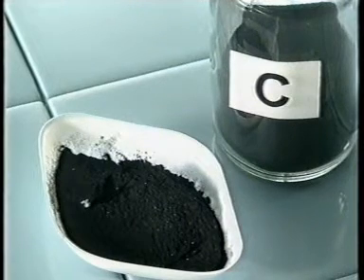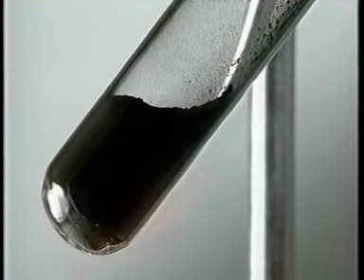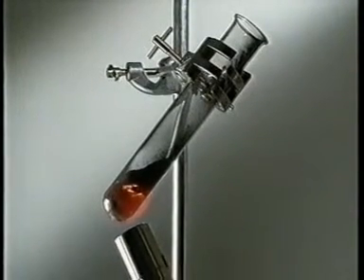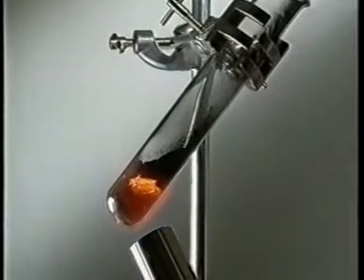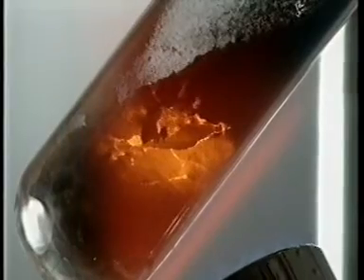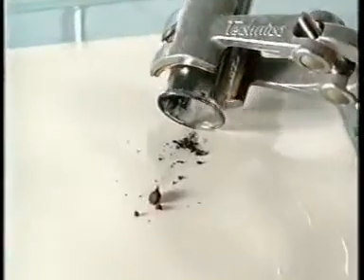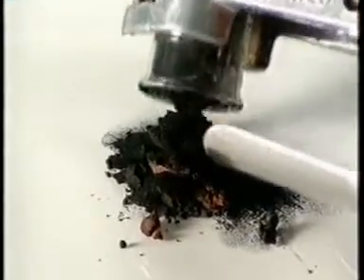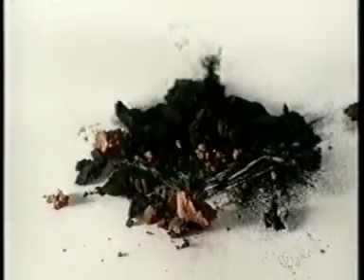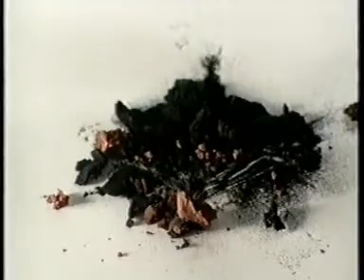Carbon is a much safer reducing agent. Mix it with copper oxide and simply heat in a boiling tube. Carbon reacts with oxygen in the copper oxide and solid copper forms. Carbon is more reactive than copper. It's able to remove the oxygen and form carbon dioxide. While the copper oxide is reduced, the carbon is oxidized.